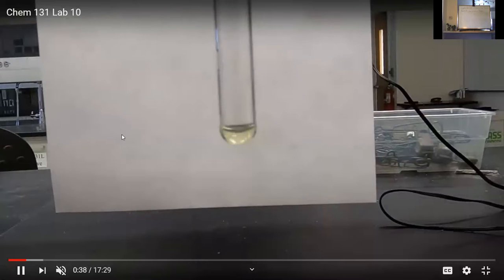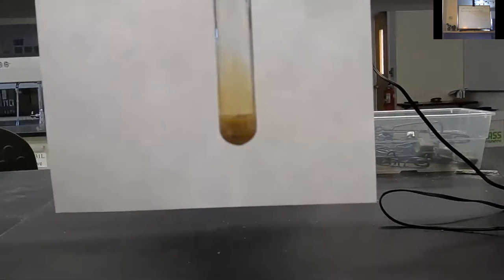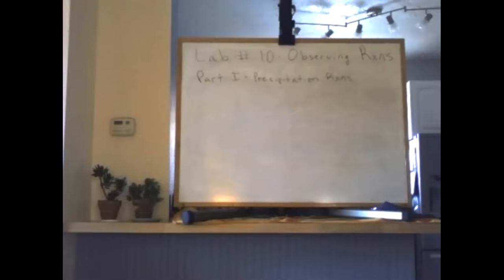He mixes copper 2 sulfate to this. Eventually, oh, there we go. Bam. This is clearly a reaction, right? So in our table, in the appropriate place, that would be a reaction of potassium iodide with copper 2 sulfate. We need to record our observations. Maybe brown precipitate formed or something like that.